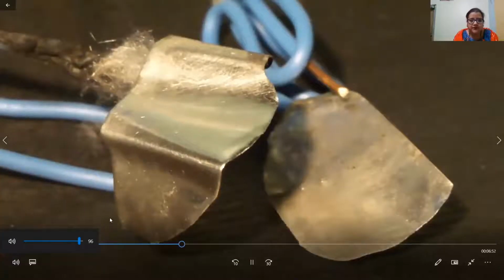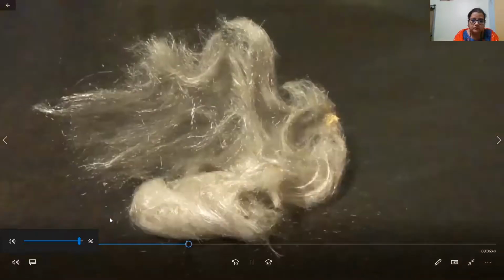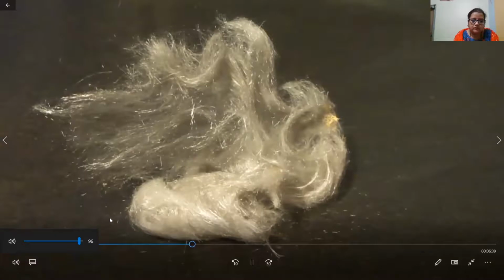As we mentioned earlier, you'll need the platinum catalyst. This can be a solid piece of platinum, for example a wire, sheet, foil, etc. However, we'll use a slightly specialized catalyst. This is fused silica wool with a thin deposit of platinum on it. The whole catalyst you see here contains less than 10 milligrams of platinum. However, its surface area is comparable to that of a soccer field. If there is interest, we might show you how to prepare the catalyst in a later video.